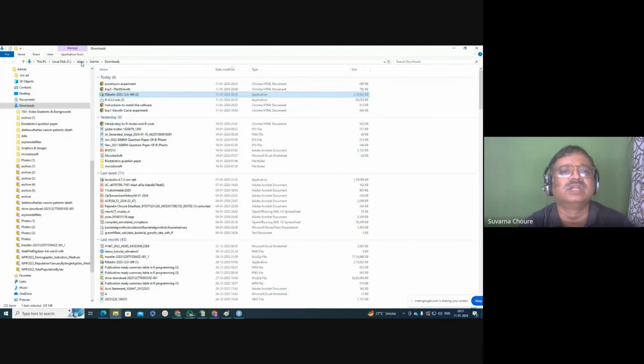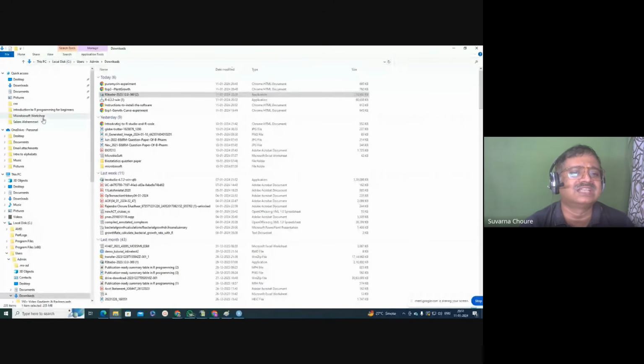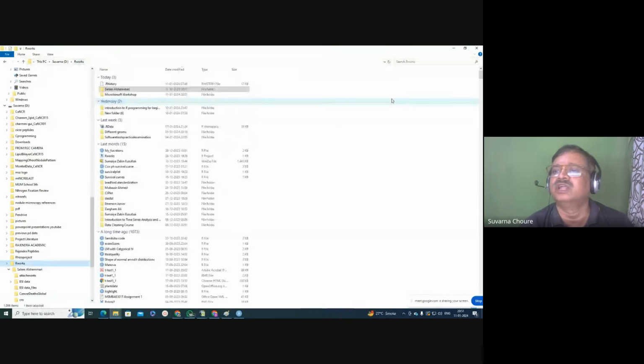That's why my Explorer is working. Puromycin experiment. Search in R works. Just last demonstration. I actually love this system very much. Therefore, it's very difficult to stop. That polyphenol experiment I will show you.